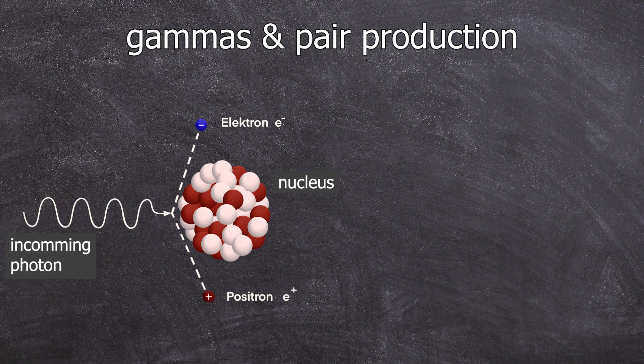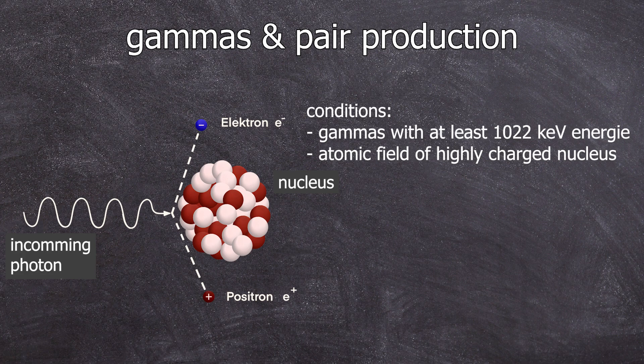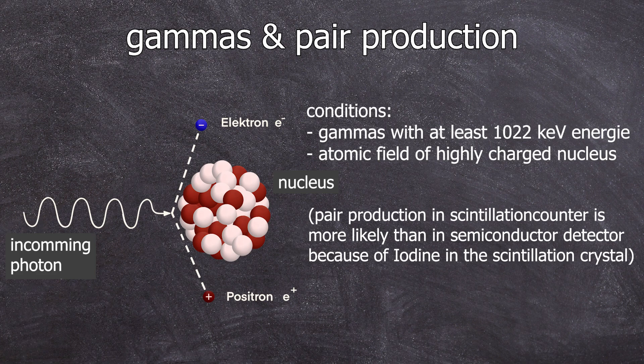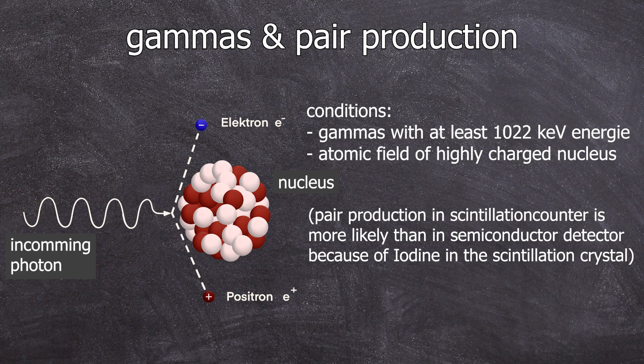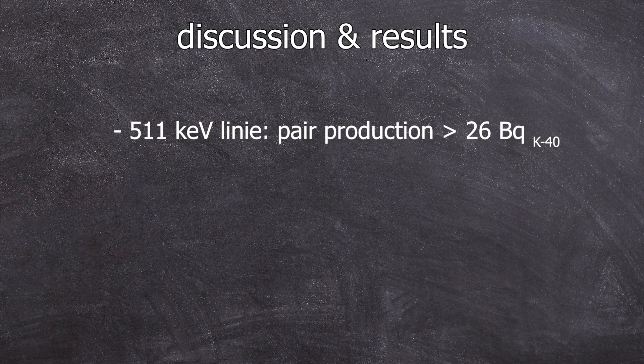There is another source that can account for this peak known as pair production. We've seen there is a natural gamma background. If these gamma photons have at least 1022 kilo electron volts of energy, and if they encounter an atomic field in an atom, probably in the air or something, they can create an electron-positron pair. This means that we have another source of 511 kilo electron volt gamma photons in the form of positrons once again. And this pair production from the high energy photons is way more likely than the 26 becquerels of potassium-40, which form positrons 0.001% of the time. But at least now we've learned something new.